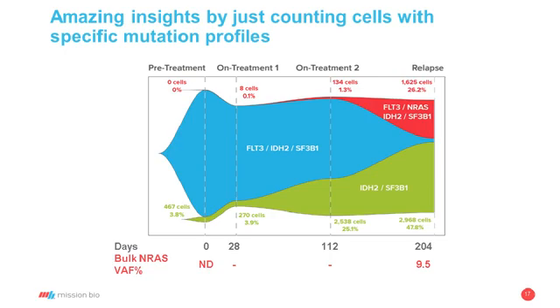In this case, there were 3 different subclones that were relevant. Each one of these subclones is essentially a group of mutations that are found in a set of cells. So the blue subclone is one that initially caused the disease. There was a treatment that was given that caused that subclone to decrease in population, but ultimately there were 2 other subclones that increased in population because they were resistant to the original treatment that was given, which caused the relapse.